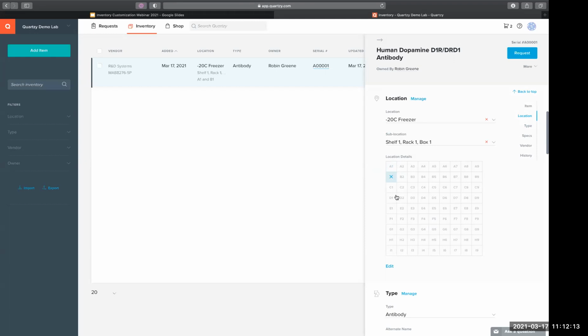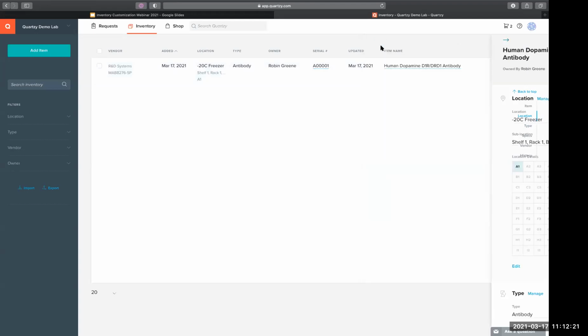All right. And so I think we'll stop for questions now. So Emily, if any questions have come in, we can go ahead and answer those. Yeah, we did get a couple of questions.